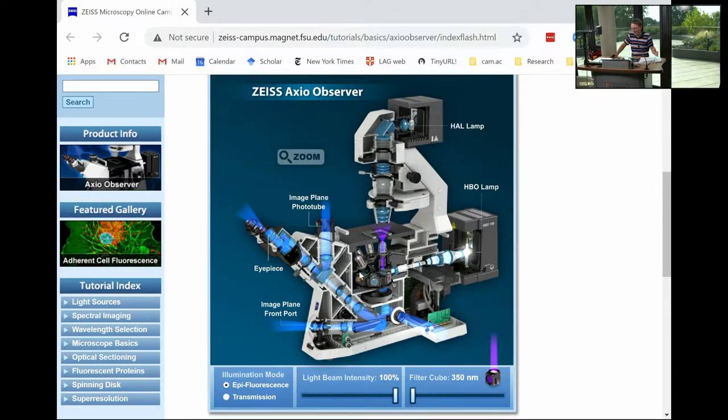And you think, God, we only ever plotted two lenses. But the fact is, we are really only interested in representing the objective here as one lens and the tube lens system as the other lens. The other ones are just relays. They are actually relatively unimportant as far as the imaging quality is concerned. And in fact, you can theoretically show that you can accurately represent any optical system like this with a 4F imaging system. That's exactly doable.